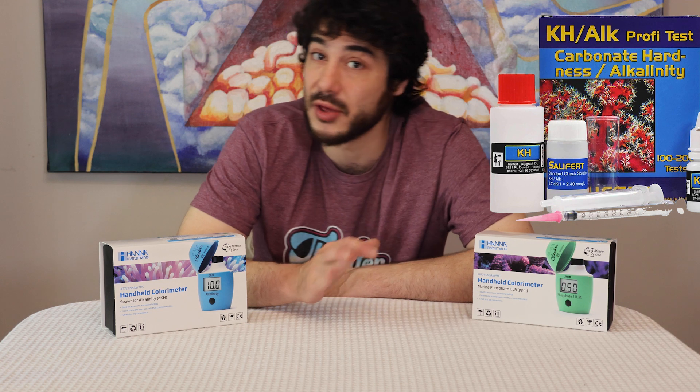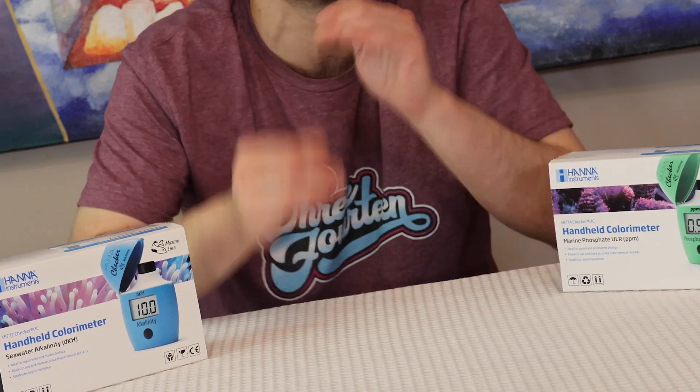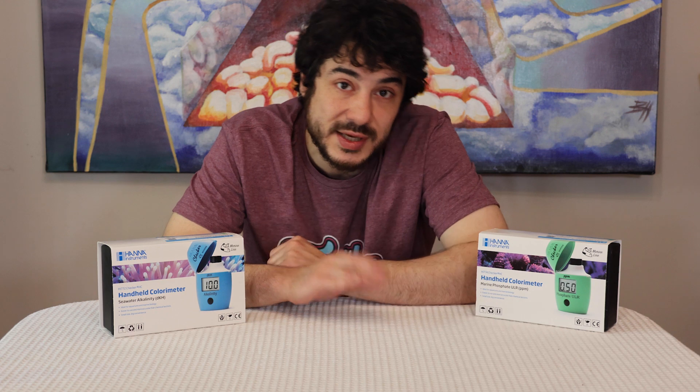Now the Salifert test kits and other top quality test kits on the market can do a great job measuring these as well. But I for one know that I like to make sure my alkalinity and phosphate are accurate, because these parameters move very swiftly in the aquarium. A little bit of underfeeding, a little bit of overdosing, and you're going to see these numbers go up and down.